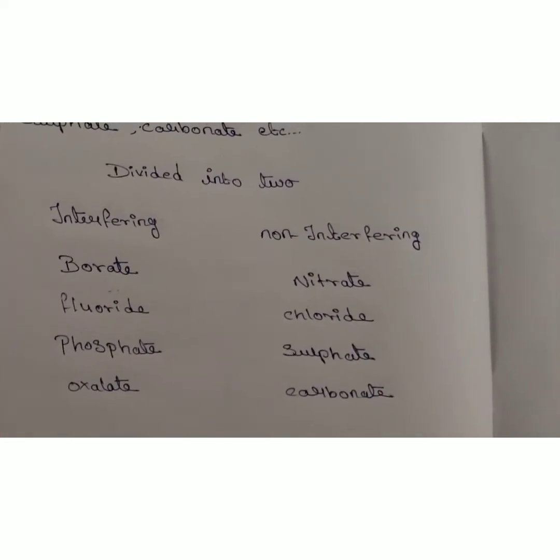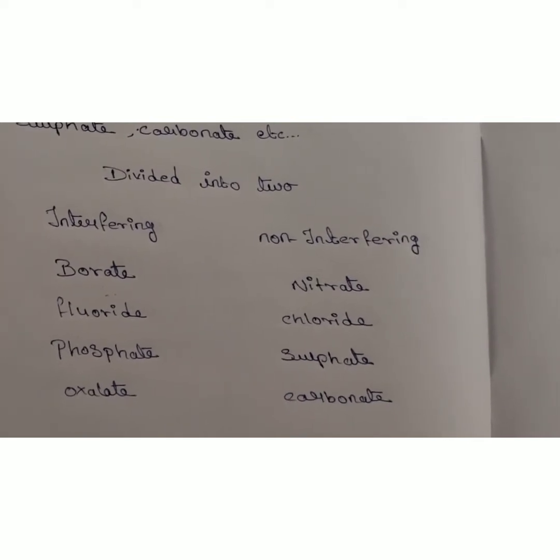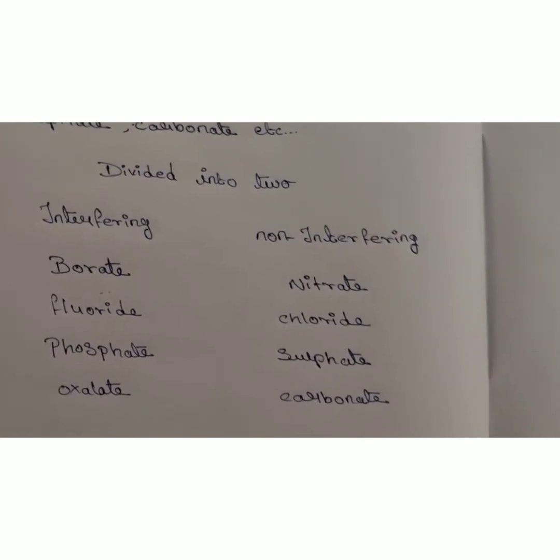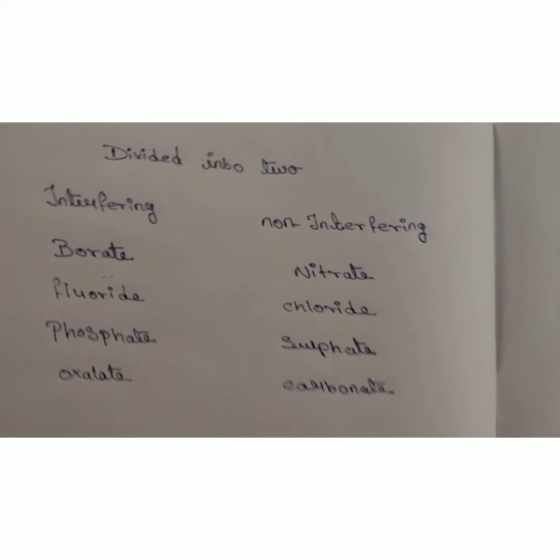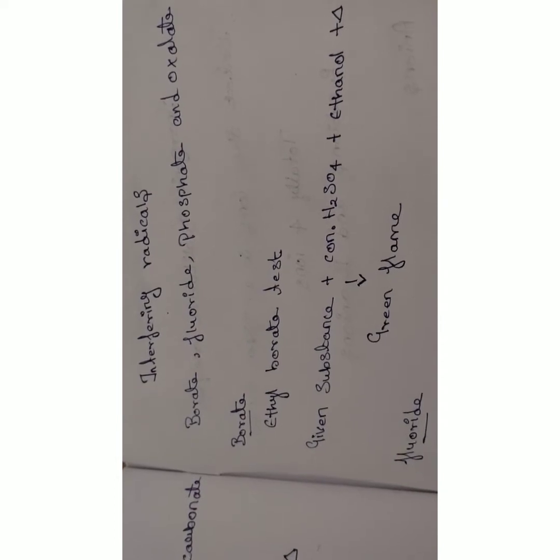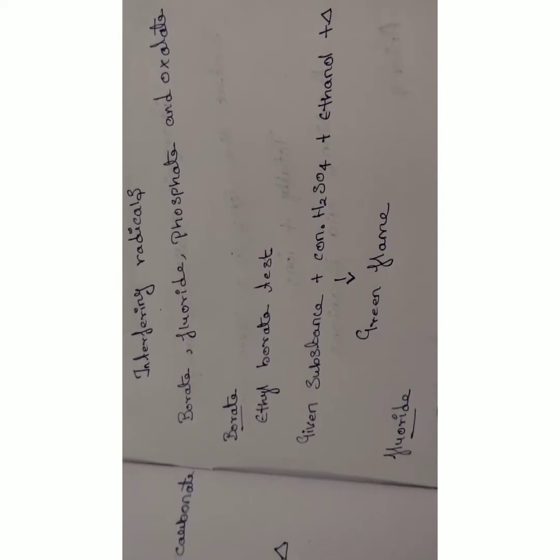In interfering, we have borate, fluoride, phosphate and oxalate. In non-interfering, we have nitrate, chloride, sulfate and carbonate. Further, we are going to see the testing methods for interfering radicals and non-interfering radicals. Now we are going to see the test for anions. Already we have separated anions into interfering radicals and non-interfering radicals. Now in interfering radicals we can see borate, fluoride, phosphate and oxalate, and how to confirm these radicals.